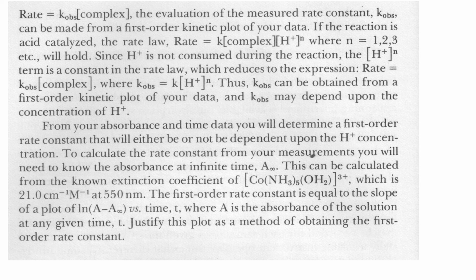You can calculate it assuming all the concentration you prepared, 1.2 times 10 to the minus 2 molar, times the extinction coefficient at 550, will give you the absorbance at A infinity. Now you plot ln (A minus A infinity) versus time for the two solutions, and from the slope you can calculate the rate constant K at 0.1 molar solution and 0.3 molar solution.